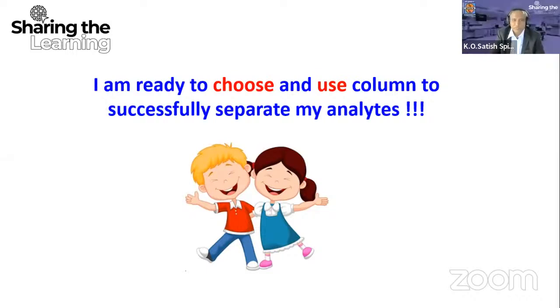So next question is from Mr. Malleshwara Rao. I was developing a method for AKBA, acetyl keto boswellic acid, but the retention time keeps changing every day. I tried everything, no problem with the system, column, sample, or mobile phase. I tried running another analyte. The retention time varies by 0.02 to 0.05 minutes.